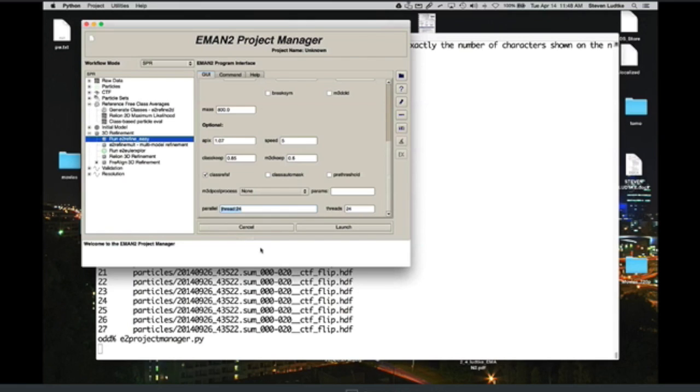If you're running an MPI, as I mentioned before, there are a few tasks in the refinement process that it can't efficiently run on multiple nodes. It really needs to use shared memory to perform the tasks efficiently. So for those particular tasks, there's another option, which is threads, which tells it how many shared memory threads it can safely use within one node on the cluster. Okay, so normally when you specify this command, you'll specify both the MPI options here and threads here. Or if you're running on, say, a local workstation, which only has 16 cores and you're not going to be using MPI, you can say thread and the number of threads, and then you can fill in the same number of threads in the box over here, and it will use that.